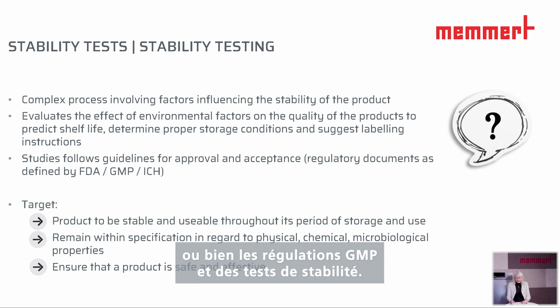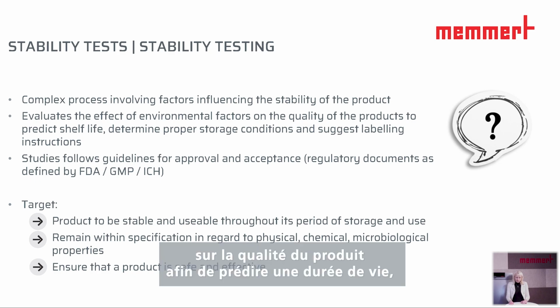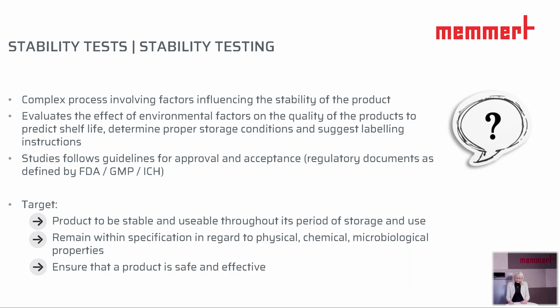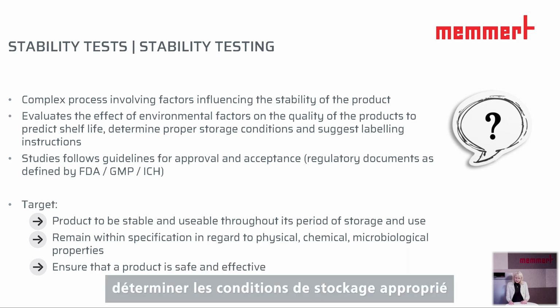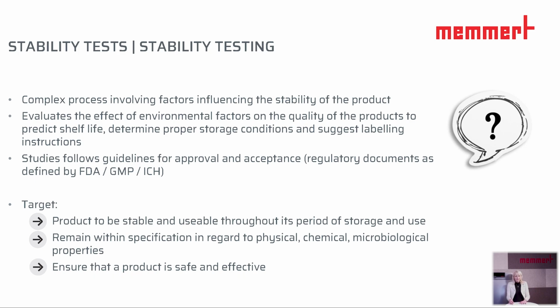And stability testing evaluates the effect of environmental factors on the quality of the product to predict a shelf life, determine proper storage conditions, and suggest labeling instructions for the product.